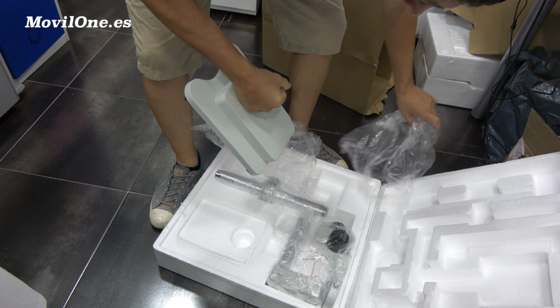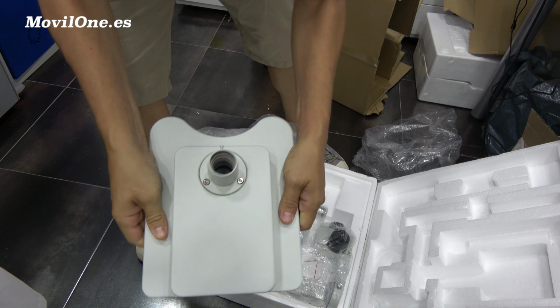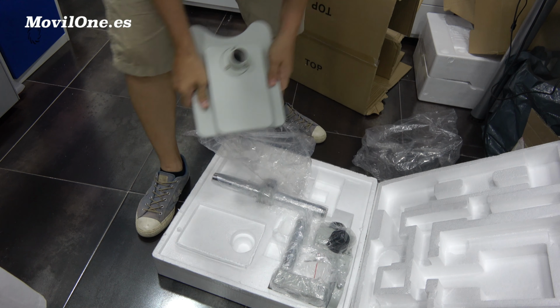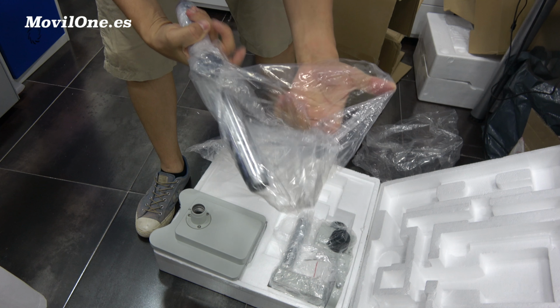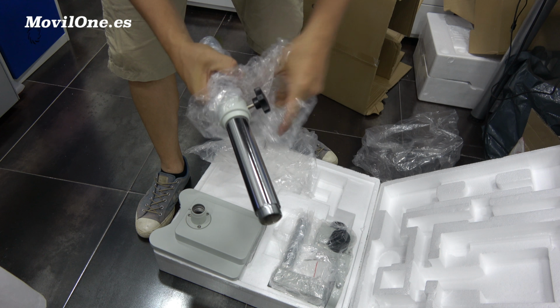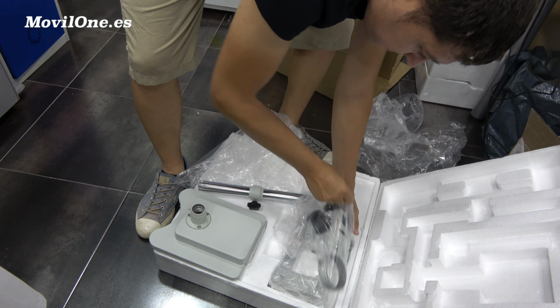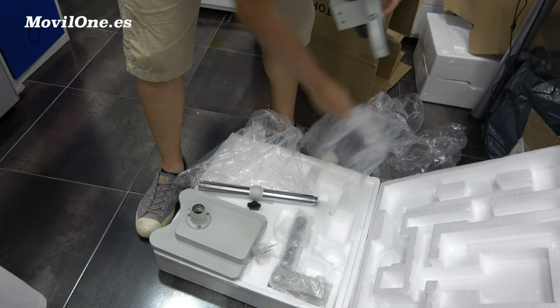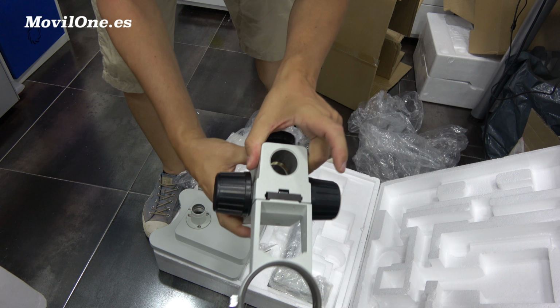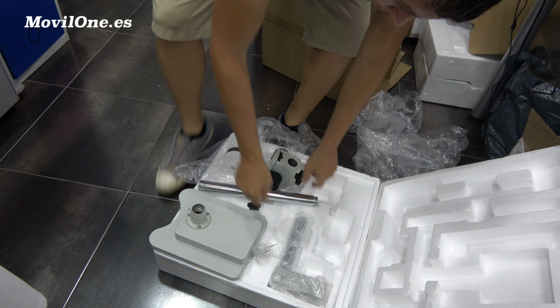We observe the base of the microscope. It can weigh around 20 kilograms. The support of the base. And for the last one, the head support.